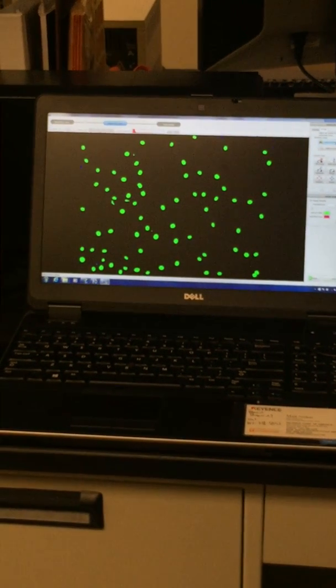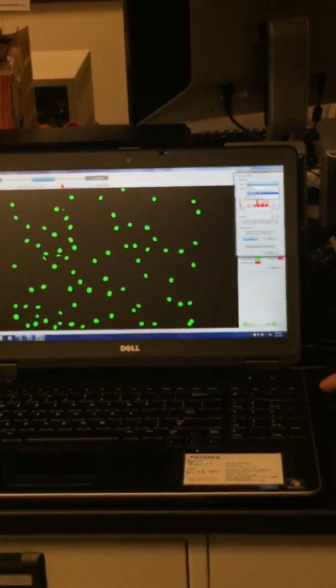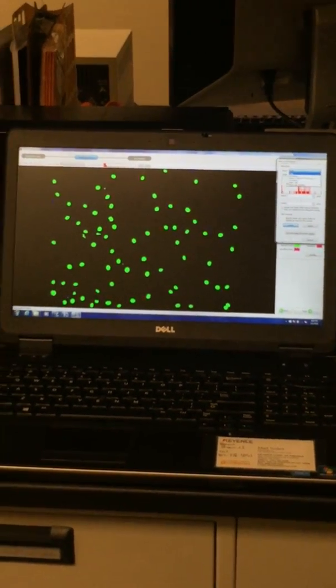And then select on histogram. A lot of people take advantage of this because you can set your size and circularity, kind of like axis or perimeter exclusions as well.